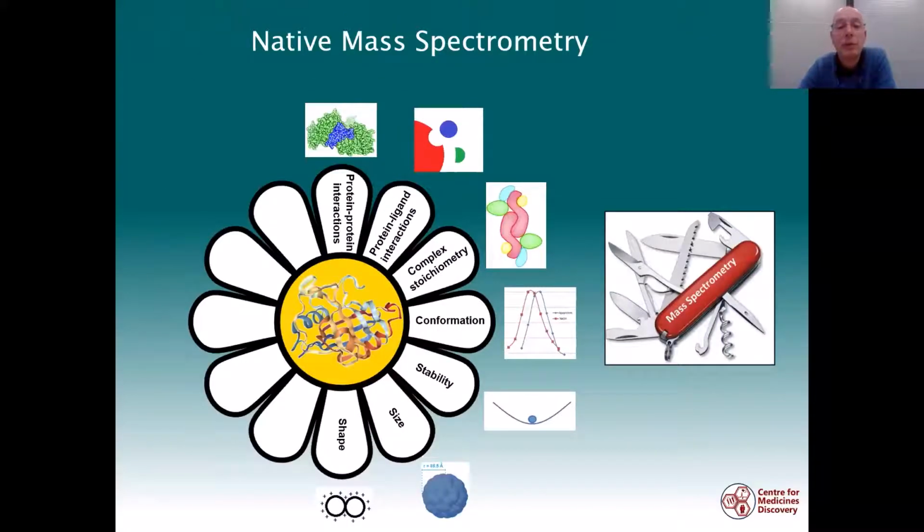So I would not recommend ion mobility as a tool to study structure, particularly. I know a lot of labs do that. My preference would be for native mass spectrometry. It is a structural tool. We've covered that in the previous session.